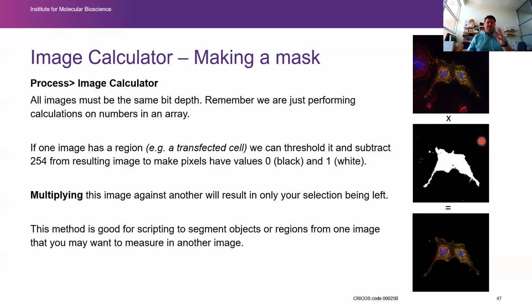And if you save 1 or 2 seconds on every image over 10,000 images, it can be the difference of something like running for 10 or so minutes versus hours or days. So it's a useful step. But the important thing is, when you get this mask or the threshold, it's going to be 0 and 255. So that's where you'd use the math subtract 254. So then this is 0, this is 1, and you would multiply that on this image. Anywhere that was 0 gets ignored, and only the values of 1 where it was green is kept.